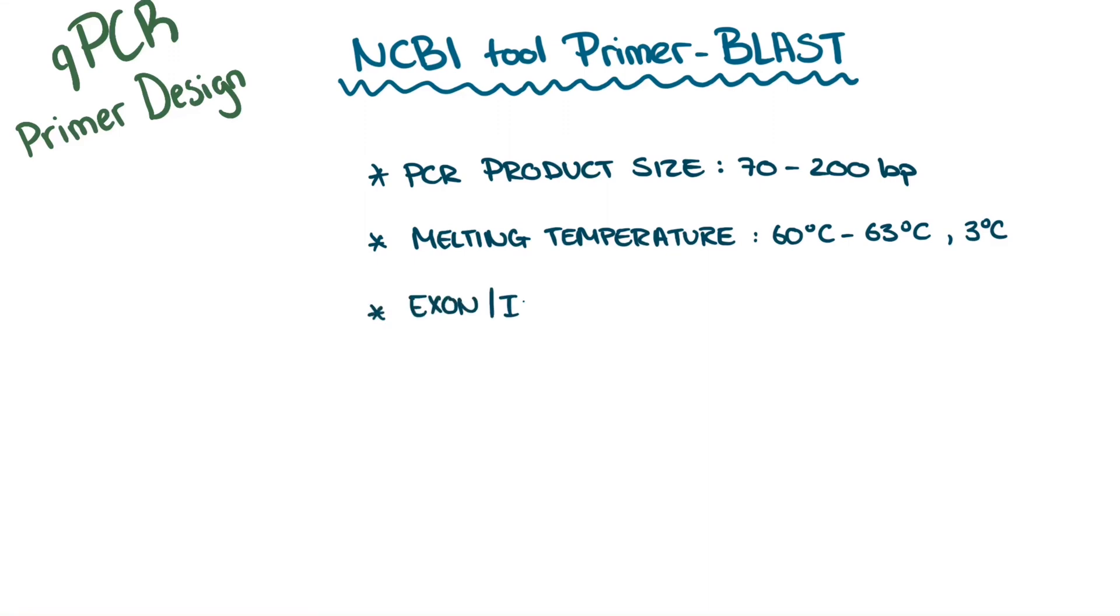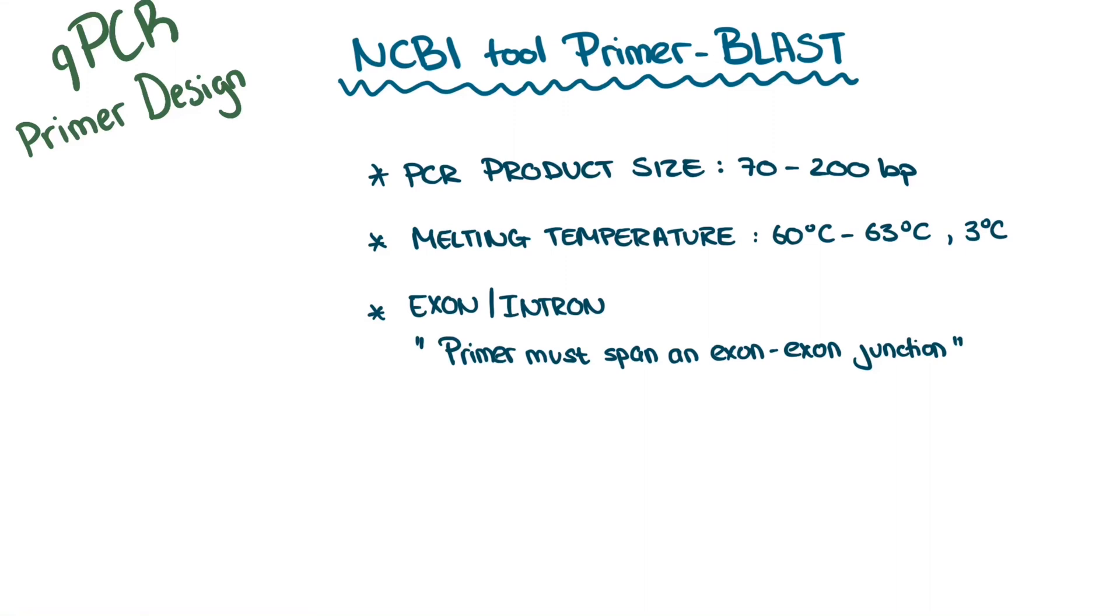And lastly, under exon-intron selection, you want to design primers so that they span an exon-exon junction. Why do this? To measure gene expression, you want to quantify how much mRNA is being transcribed.